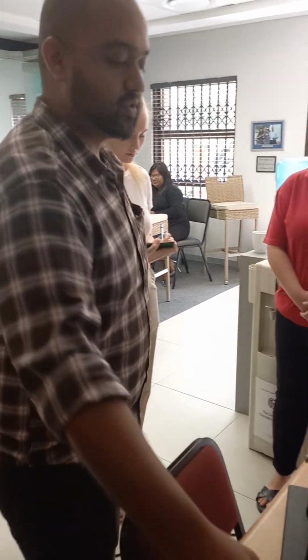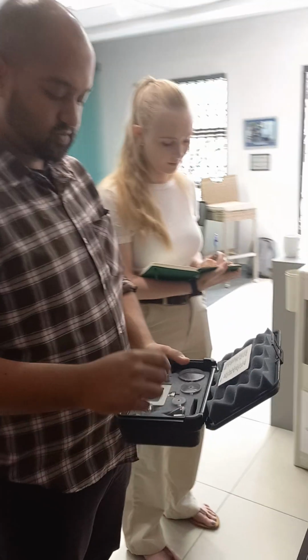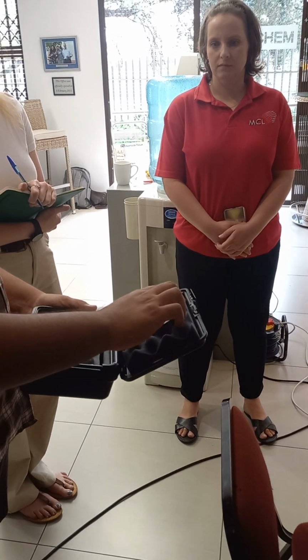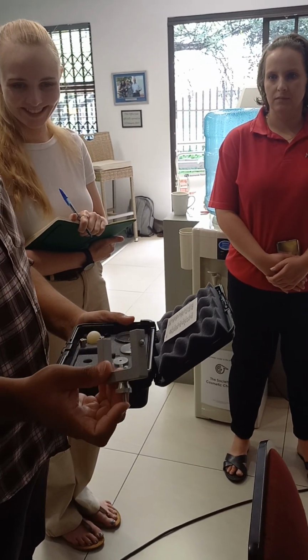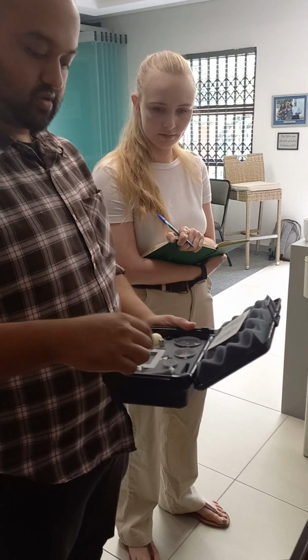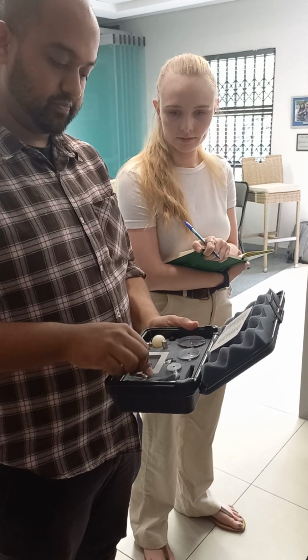Okay, so let's move on to the fixtures. Brookfield has a massive range of fixtures, in fact, it's almost infinite. This is what we would supply to you as a starting point for measuring your sample and getting some data from it. This is like a cutting blade. This would be used generally for cheeses. This measures the force of a knife on something. This is also for cutting as well. You see it has that point on the end, so this will cut into the sample as well.